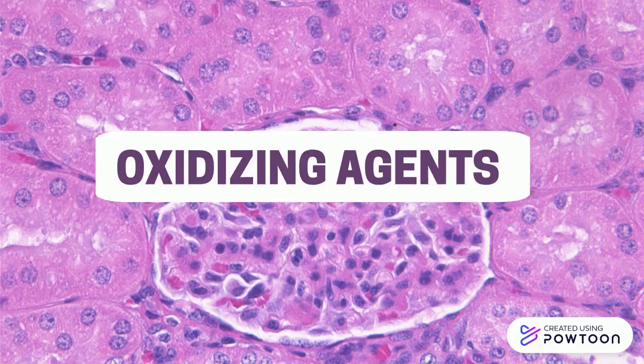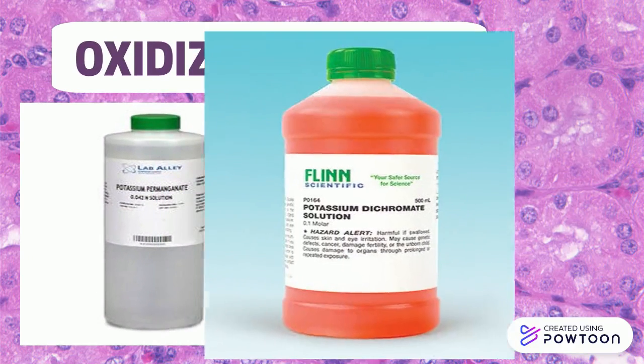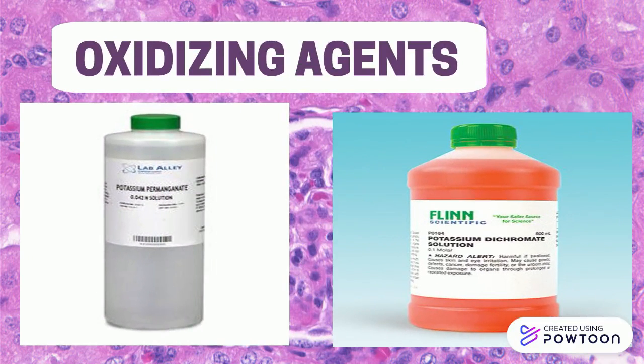Oxidizing agents include permanganate fixative, dichromate fixative, and osmium tetroxide. They cross-link proteins but cause extensive denaturation. Some of them have specialized applications but are used very infrequently.